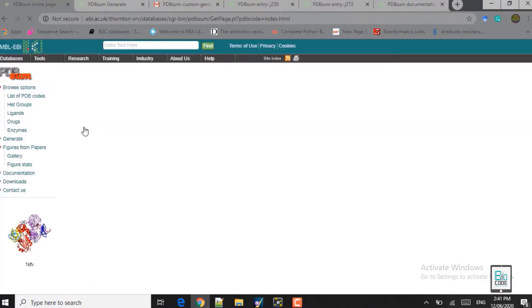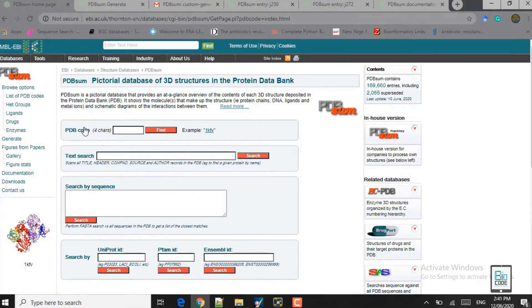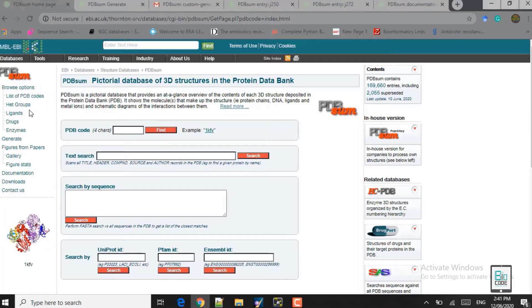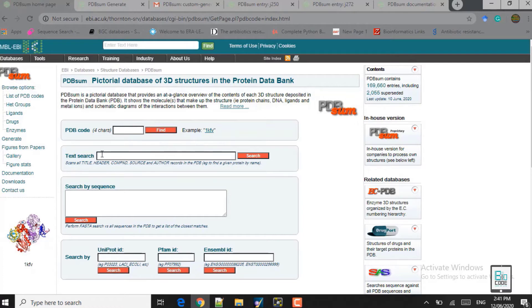The link to PDBsum will be provided in the transcription. Here you can see the window that opens in PDBsum. You have some browse options: the list of PDB codes, the Het groups, the ligands, the drugs, and the enzymes. You can click on each of them and browse to the structure you want to evaluate. Alternatively, here you can provide the PDB code, the title of the paper, the name of the compound, or the name of the author in the search box and click on search.